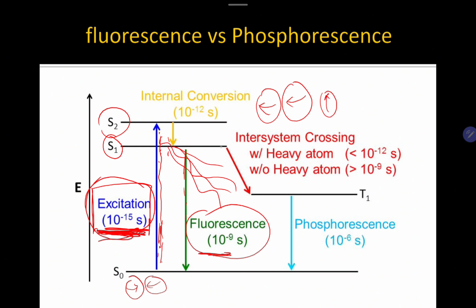Since the atom undergoes these changes, the light they absorbed, or their excited state, will last longer. They will spin longer. Got it so far? If they spin longer in their orbital, it means they cannot release energy yet, since they have not returned to their ground state. There is a time delay, which is why the light emitted by phosphorescence is delayed.